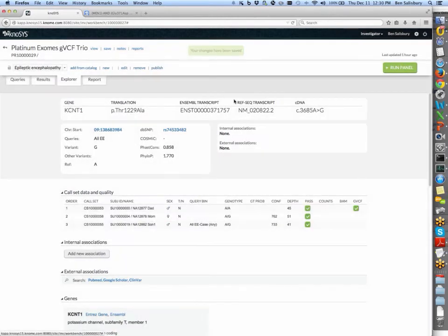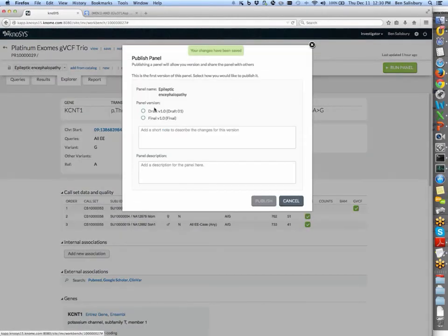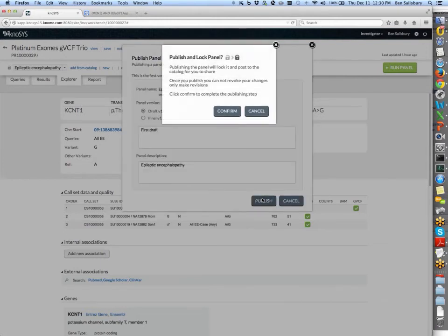I have to save the project first. And now we have the opportunity to save this as a draft or final, and obviously I was just getting going. This is just a first draft. Ultimately, I would want to play with that some more, maybe try it out on some other data sets, break those genes down into the appropriate inheritance modes, set frequency cutoffs, etc. Put in our description there, and we can publish.